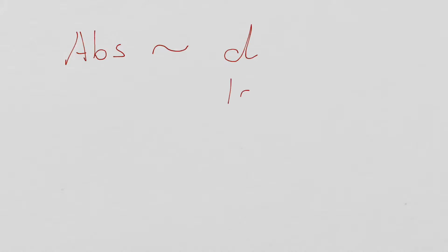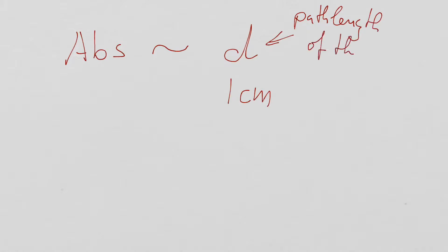That is the path length. Some people call it path length of the cuvette. Okay? Does it make sense?